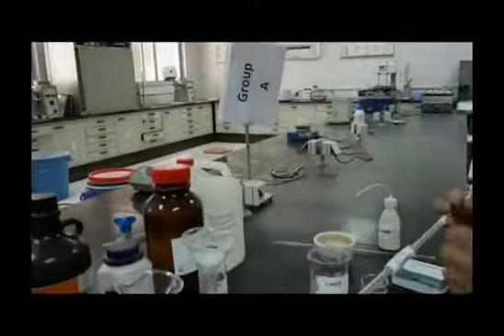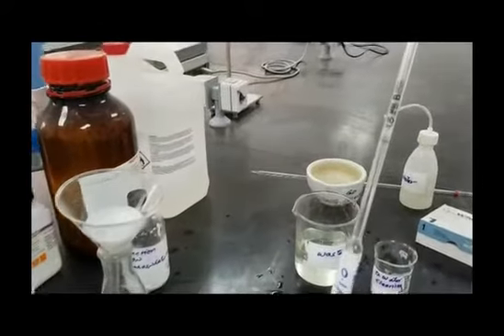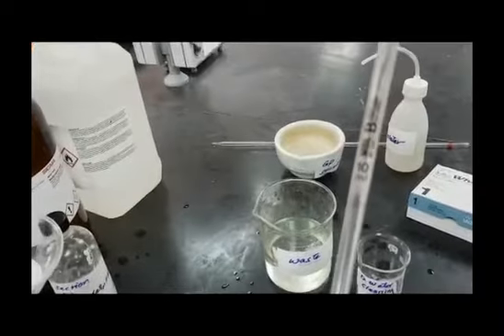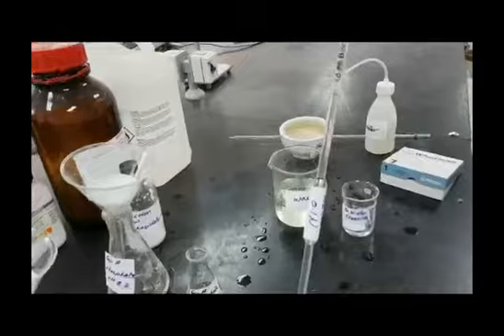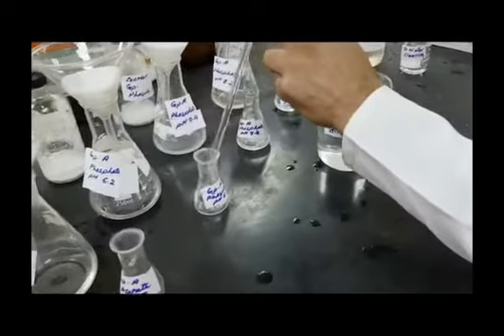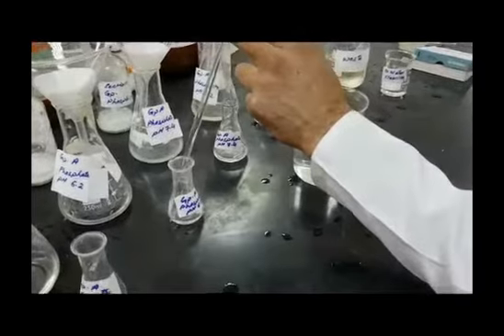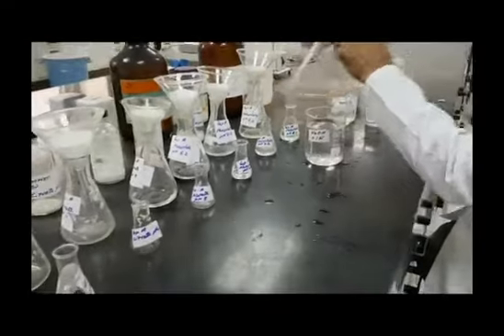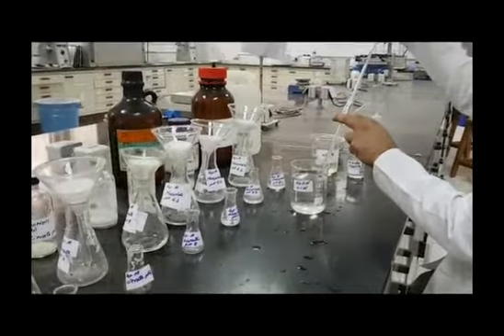Here the dilution factor will be 2. Dilution factor is equal to final volume divided by the initial sample volume. The final volume is the total volume of the diluent, sodium hydroxide, and the sample itself.